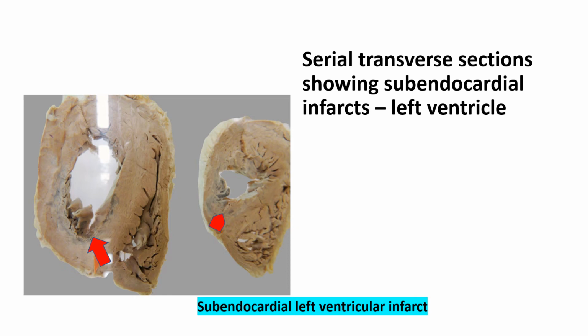There may be a full specimen of the heart, or there may be serial sections showing this type of lesion. In various institutions I have seen various types of specimens, but the main lesions are very similar, and the description is the most important thing. And this may be kept at the OSPE. So there you have to write shortly and correctly.